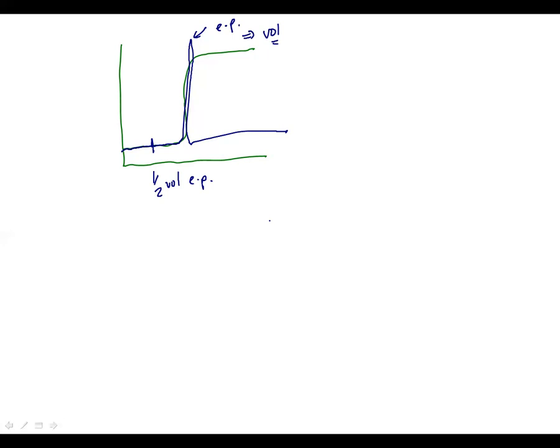So again, in part 1 you have the entire titration curve and you want to graph it, so obviously you need to identify those points. You'll need to use the curve to get things like the Ka value and pKa value, and since the part 2 weak acid is acetic acid, which has a known value, it should allow you to calculate things like error. Any questions on part two of the experiment?